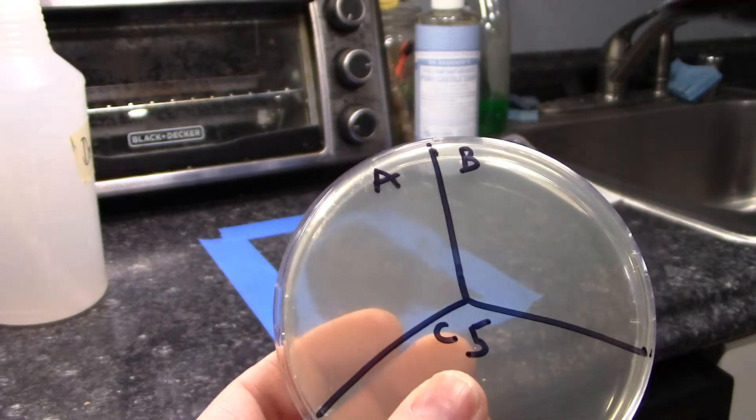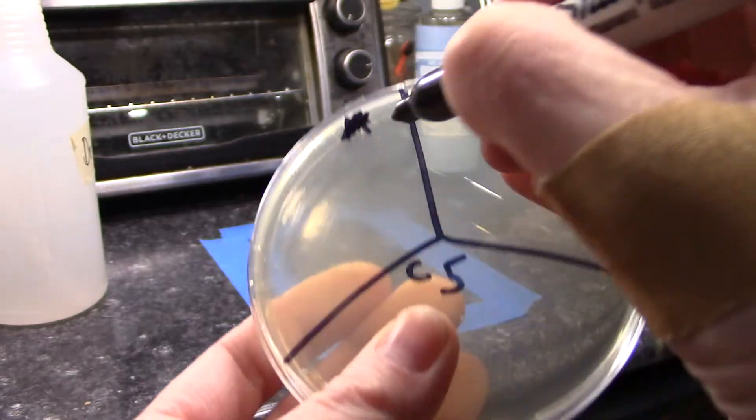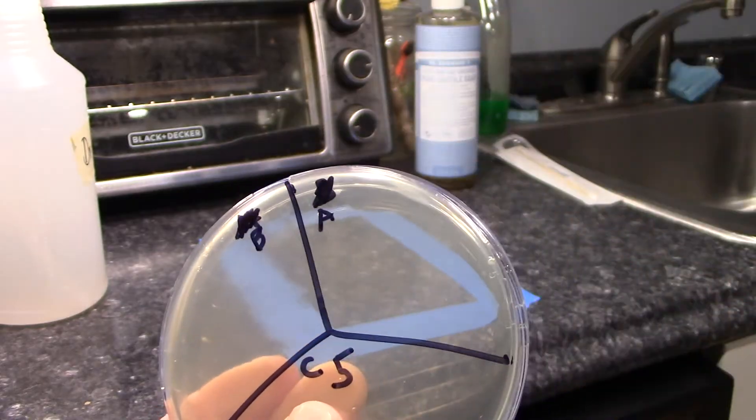By accident, I put the before sample in slot A. So I'm crossing off A and writing B for before, and making the other one A for after.